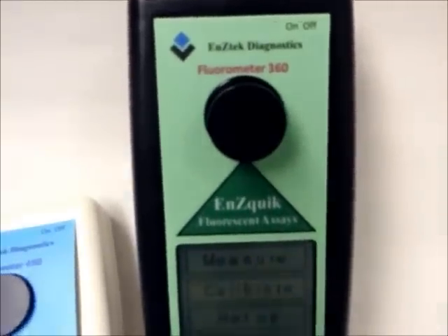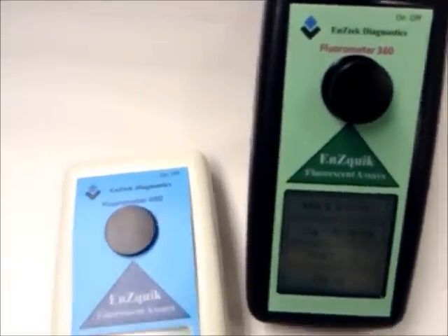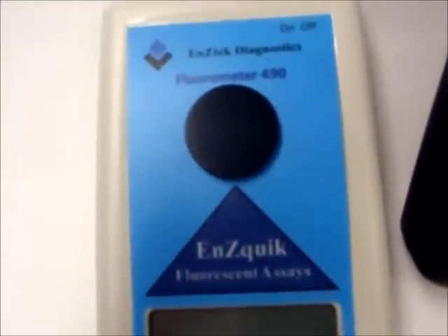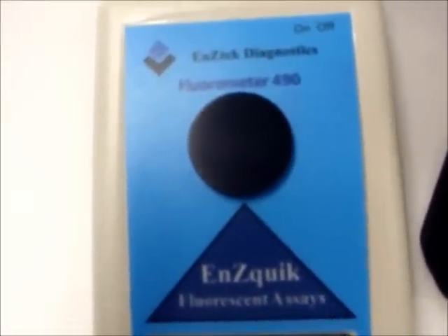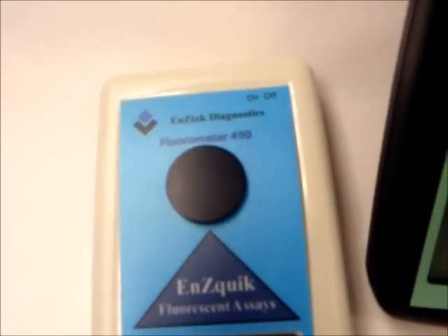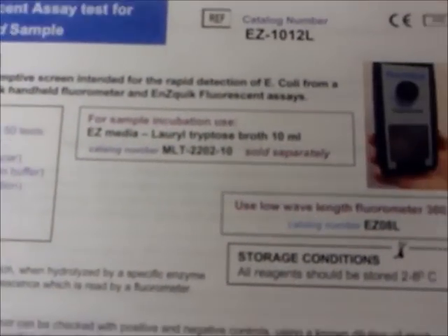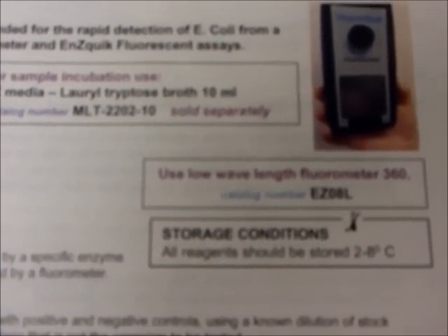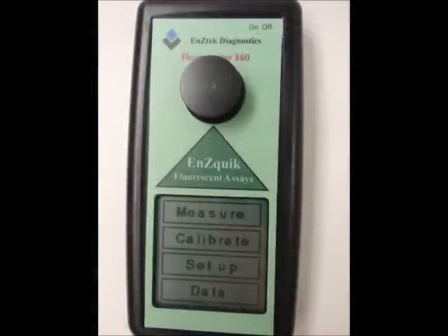Several of our assays require a low wavelength fluorometer, or 360 nanometers, and others require a high wavelength fluorometer, or 490 nanometers. Our product inserts and catalog list which fluorometer is required for each assay. The demonstration performed for this video will be conducted using a handheld fluorometer.